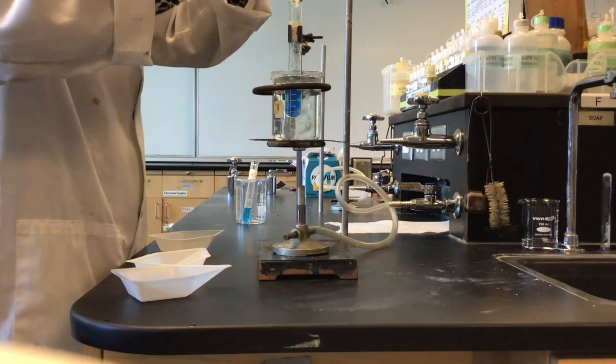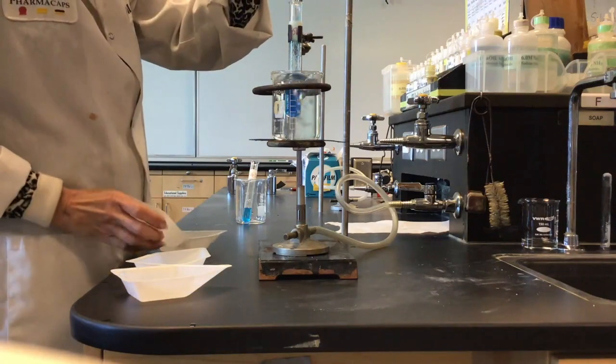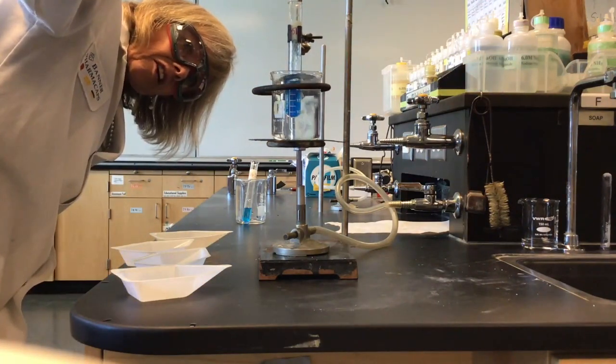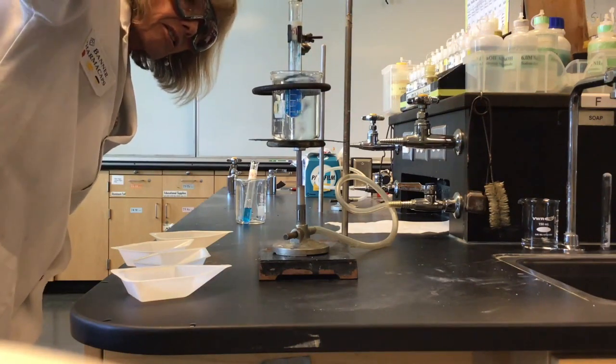Let's find out if our water can handle any more copper sulfate. Then the physical agitation is also helping to dissolve it. It looks like it has dissolved again.